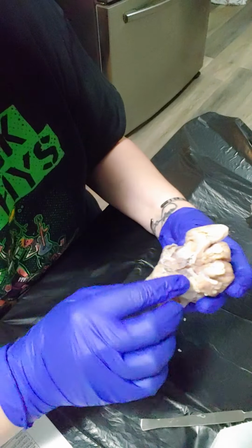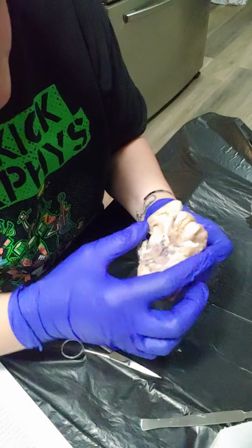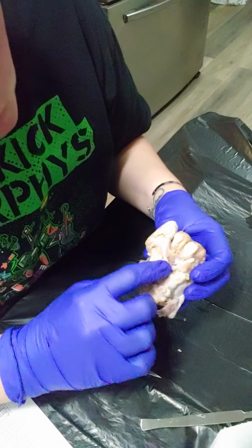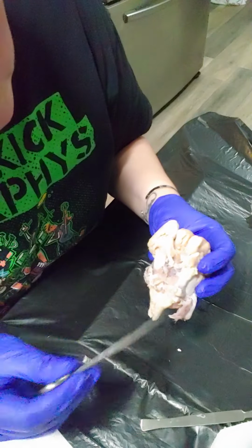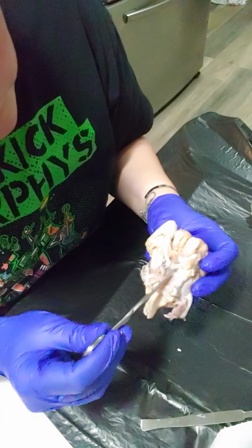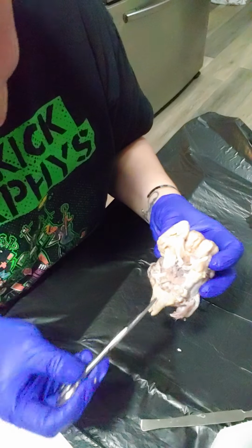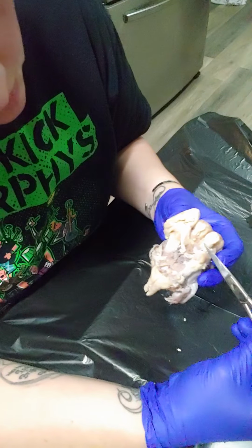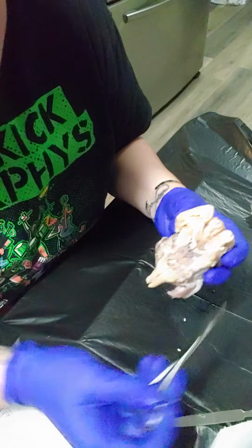Next is the optic chiasma, which is kind of why I didn't cut this big piece off, because pre-dissection you could see it was all one piece. This little horn structure right here. This is the crossover right here. That is your optic chiasma. Going up, these are going to be the olfactory bulbs, which are apparently larger in sheep than they are in humans.